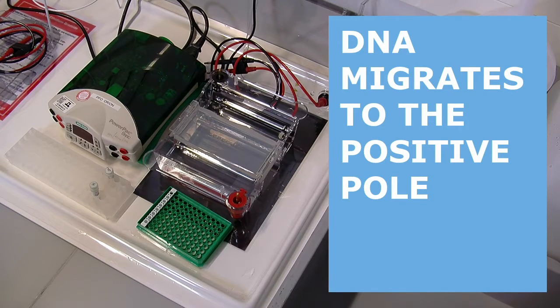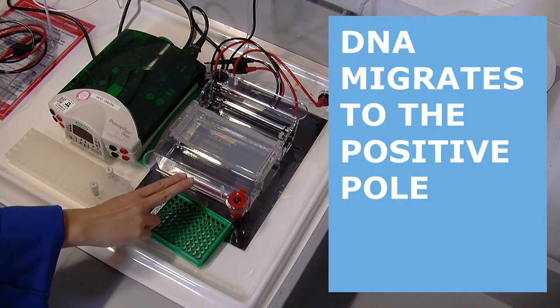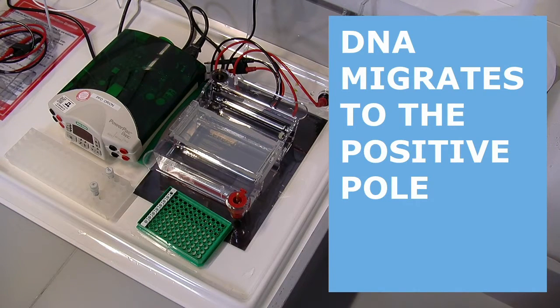DNA is negatively charged and thus migrates to the positive pole. The slots are located at the negative pole.